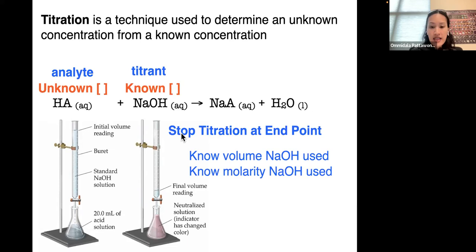In this case, the known volume of sodium hydroxide and also the molarity of the sodium hydroxide will allow us to find the mole of sodium hydroxide, and then eventually we will know the mole of acid that reacted, right? That means it doesn't matter how many moles or what type of acid we use. We don't care about the type. We are going to look at the total overall acid. The amount of acid available in fruit juice, we assume, will react with the sodium hydroxide that we titrate.